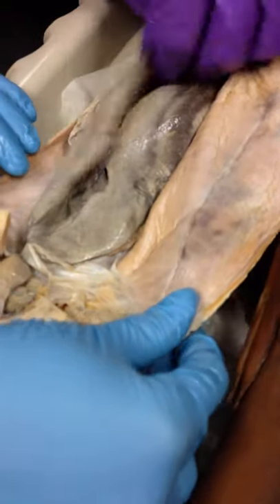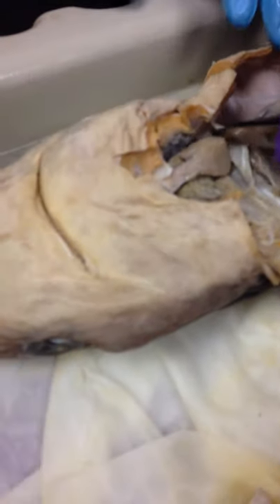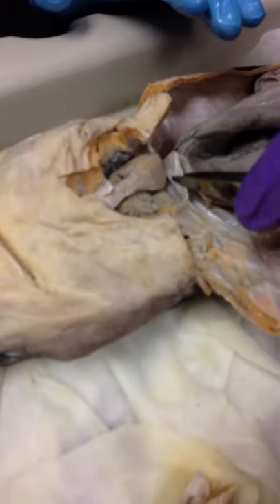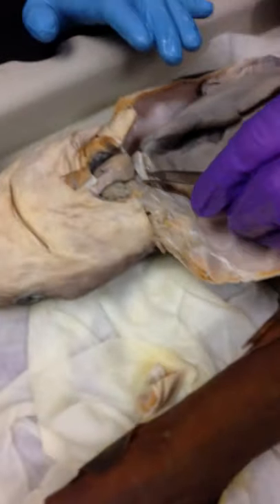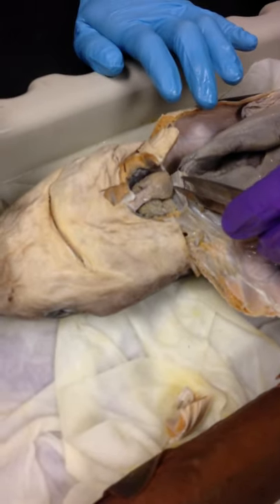All right, now we're going to go up into the pericardial cavity, the hardest part of the whole shark. Here's the heart. So the pericardial cavity is the cavity around the heart. Before we get to that, careful, there's a membrane right here. It's an important membrane. There's a membrane right here called the transverse septum. Whoever did this dissection destroyed most of it. Anyway, so here's the transverse septum.